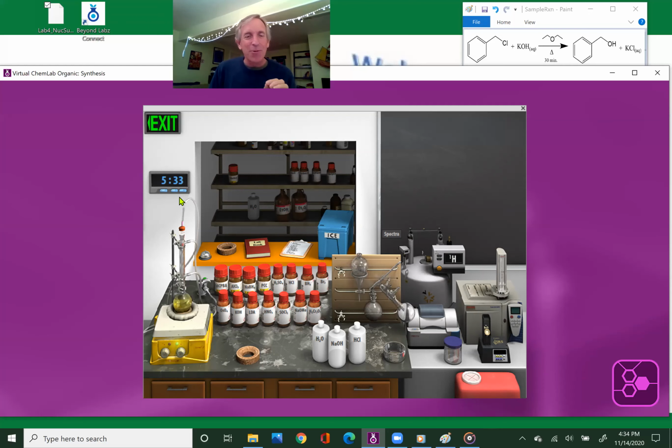So now we want to just change the time, speed up time, and make the reaction go 30 minutes. So you can do that. If I click this button here, this will automatically put 1 hour of time into my reaction. If I want 30 minutes, this adds 10 minutes, and this adds 1 minute. So I can click the 1 minute button 30 times, or the 10-minute button 3 times. 1, 2, 3.